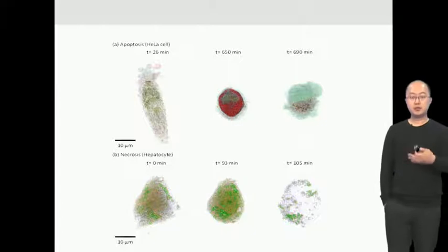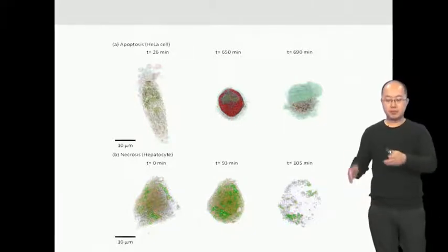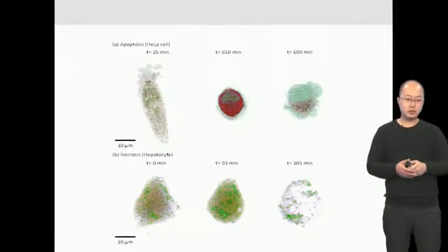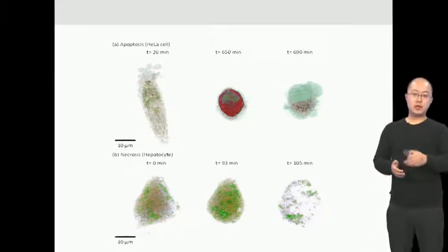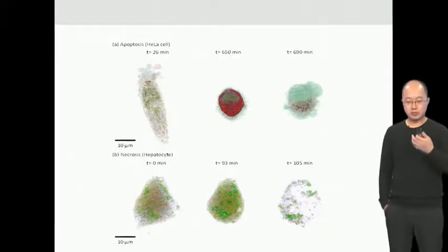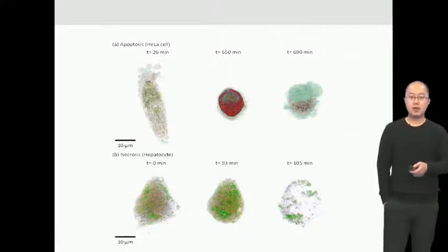And we can also measure the 4D refractive index tomogram. So you can measure time-lapse images of the three-dimensional refractive index distribution. So by measuring those movies, you can investigate unprecedented, very novel images that were not possible using the previous conventional optical microscope schemes.